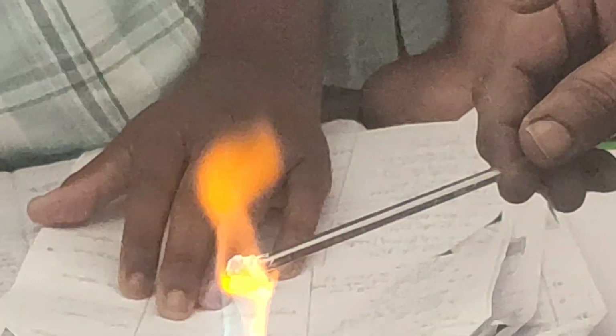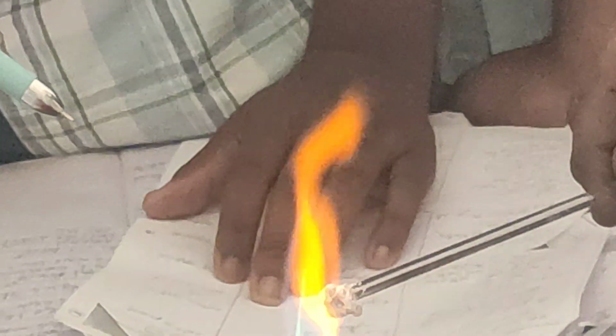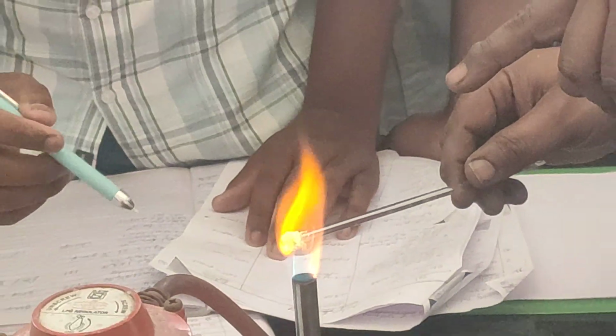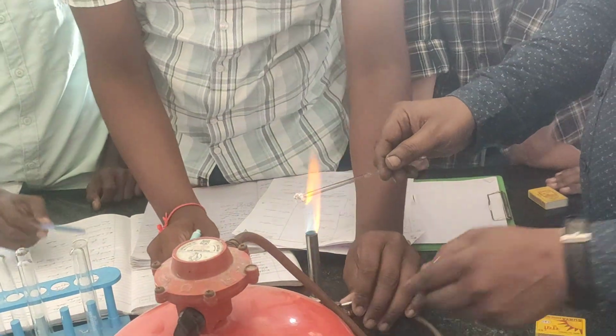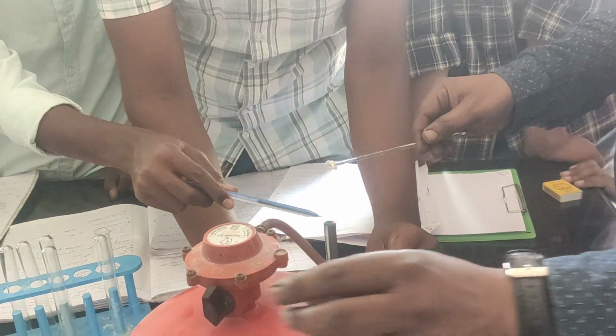Now this calcium is a cation. First we got the anion, CO3 minus 2, and the cation we got is calcium. So this is the flame test.